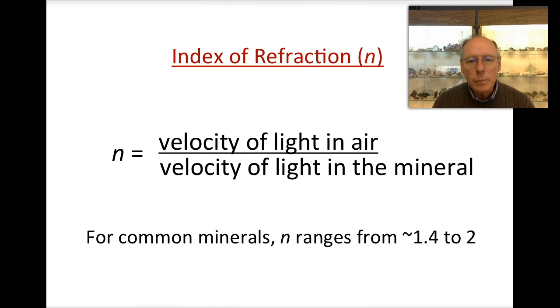Today I'm going to be showing you how to do what's called a Becke line test on the microscope. But before we do that, as background, we need to understand a few things about indices of refraction. A fundamental property of all minerals is that they have an index of refraction. The index of refraction is defined as the velocity of light in air or a vacuum divided by the velocity of light in the mineral. For common minerals, these values range from about 1.4 to 2.